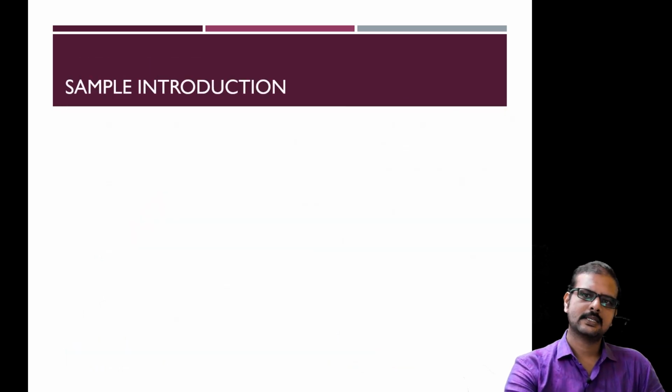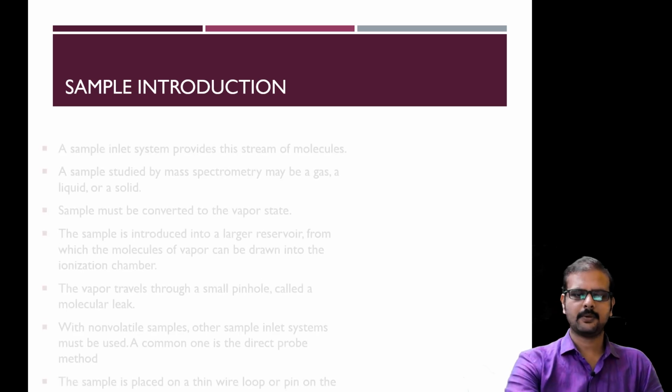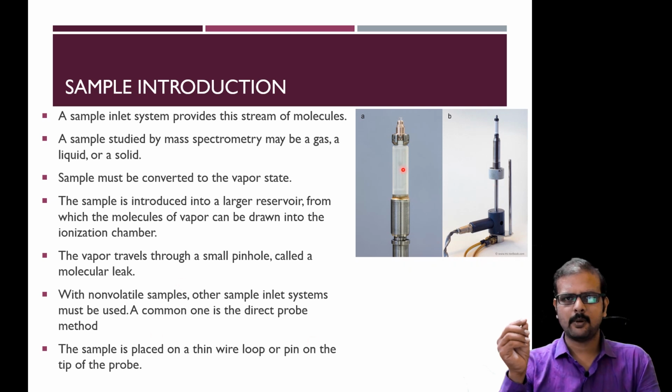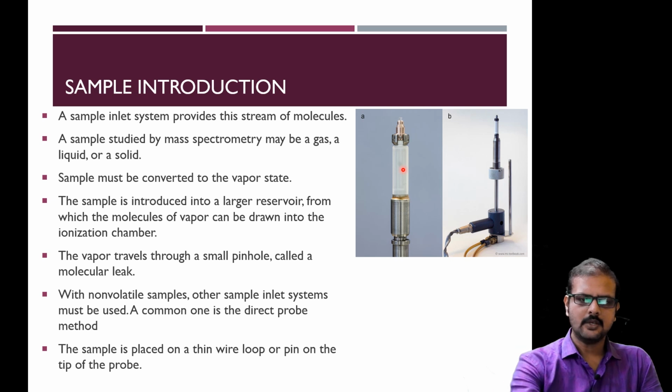So the first one is sample introduction, or a sample inlet. Simply a sample inlet. A sample inlet will look like this. That is, it has a simple probe, which is used for sending the sample inside the ion chamber. So the ion chamber will receive the molecules, or the sample, through this probe.